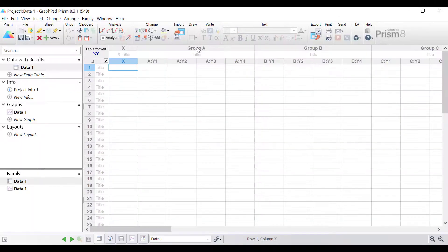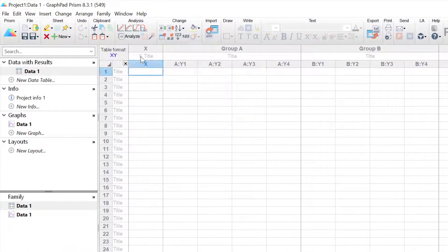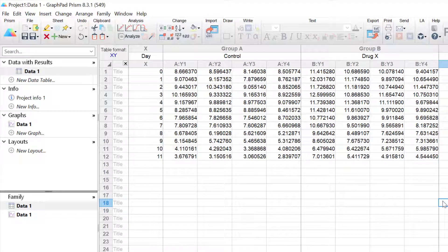I'm just going to paste in the data that I have prepared earlier. There are two experimental groups in this data set, control and drug X, and there are four replicates in each group. In this example each replicate is a separate person. Data for the X axis is the day number from baseline to day 11, and each measure is the concentration of protein Y in the blood.